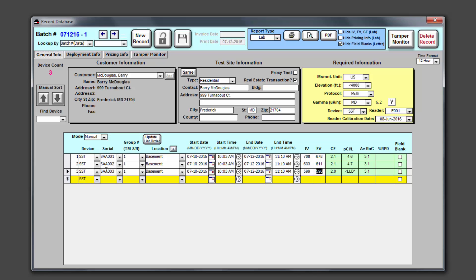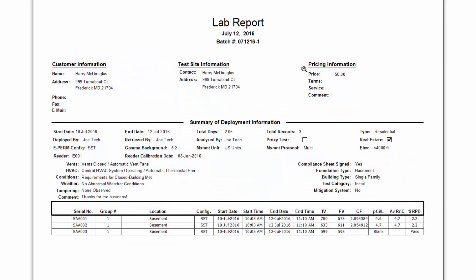As soon as we do that, you'll notice that our average radon concentration changes, and this new detector shows up as measuring a concentration that is less than the lower limit of detection. We don't want this detector to be classified as a normal detector and bring our grouped average down, so we click on the field blank checkbox at the far right end of the row. As soon as we do that, we'll see that our previous average and radon concentrations are restored, and this detector is now officially classified as a field blank. After it's all done, we can preview the lab report and see our blank detector — SAA003 — alongside our other two detectors. It's clearly labeled as a blank, and we know that its voltage loss was acceptable because it's marked by a pass result.